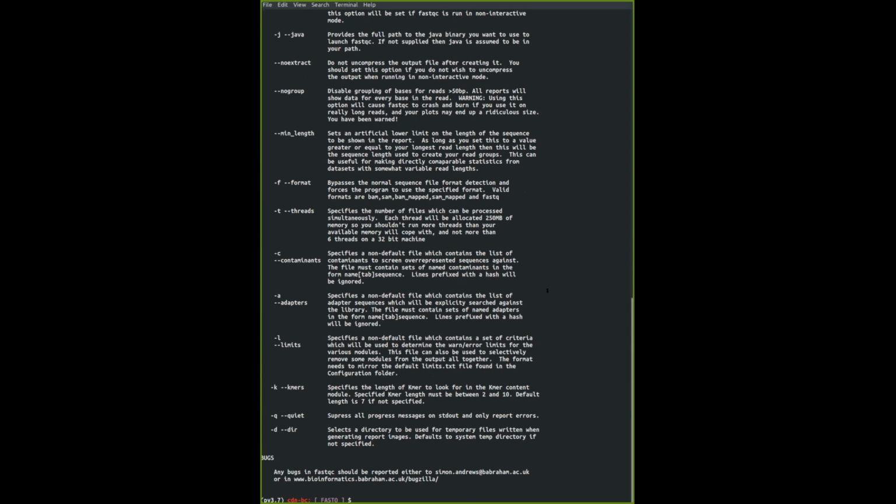So as mentioned, we're going to run FastQC using scripts. I think this is quite fun because you do not have to retype your code again and again. You can use this script and change several pieces of information. You can duplicate this script and use it again and again for different experiments, different projects, just with a click of a button or press of enter, and the whole script will run for you. So it's like creating a robot and watching the robot do work for you. That's the best thing ever.